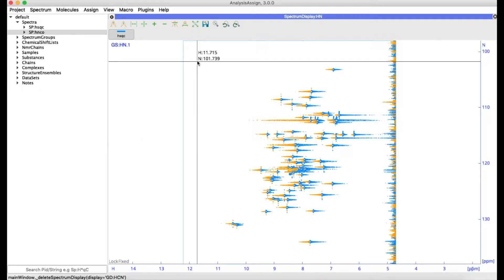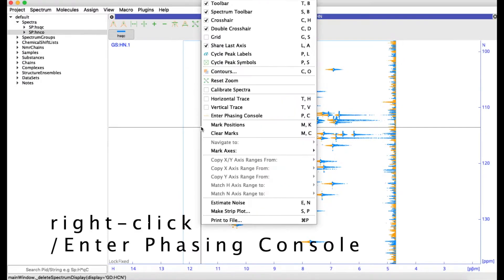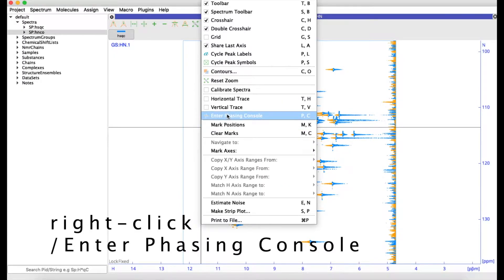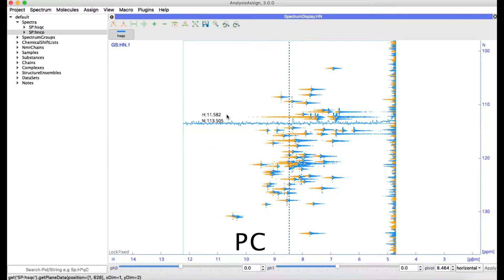If you use a program such as NMR Pipe to process your spectra, you can use CCP NMR Analysis to obtain your phasing parameters. Open the phasing console by right-clicking and selecting Enter Phasing Console, or you can type PC.